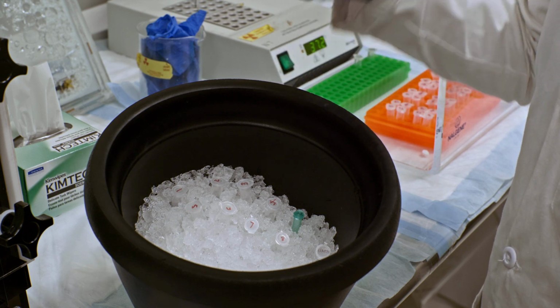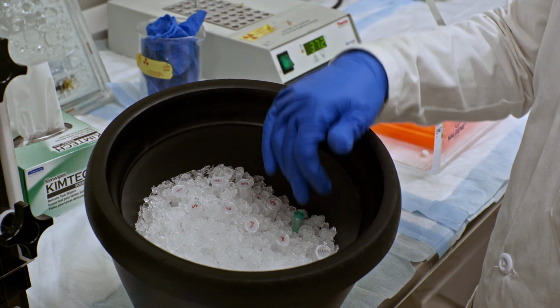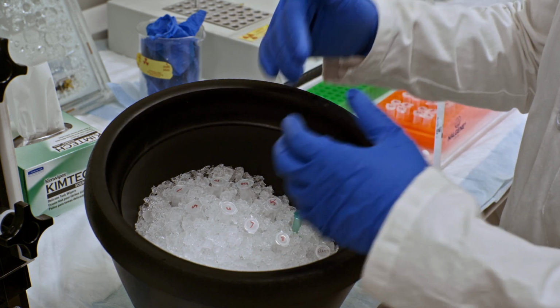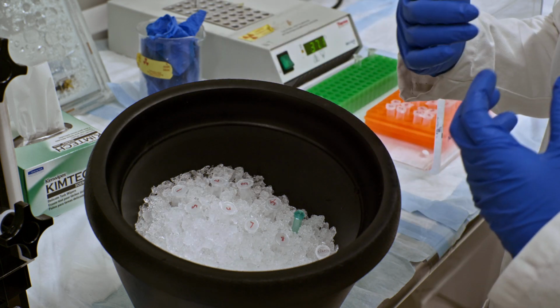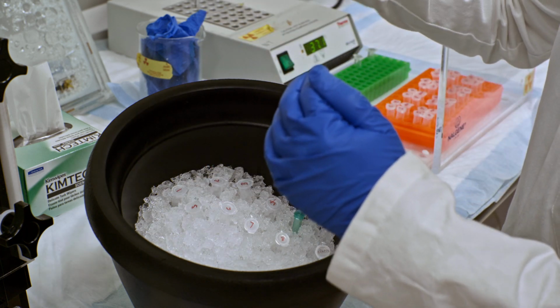From there, to initiate the reaction, we need to incorporate dNTPs into each one of these vessels. This is the very last thing we want to do because, of course, once you start the reaction, you're committing to getting samples at particular time points for this reaction. You will run this reaction at 37 degrees Celsius in order for the polymerase to work efficiently and to catalyze the addition of these dNTPs onto your primer. And so you should see addition products over time.